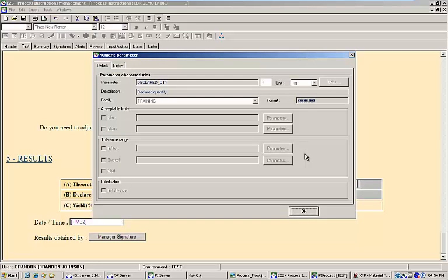Work instruction data fields can even be linked together using contextual metadata to make reporting easier and more efficient. All of this ensures that the data captured in the EBR system can easily be transformed into usable information that can help to satisfy regulators as well as track and improve the manufacturing process.